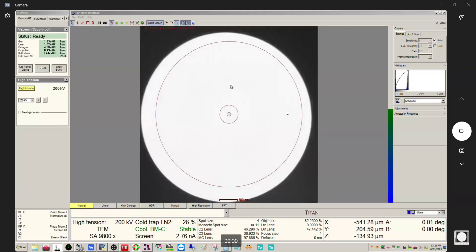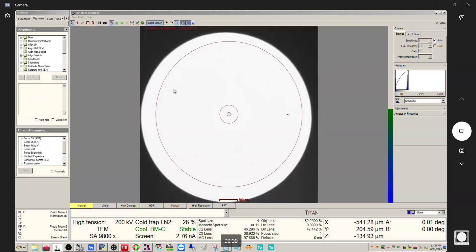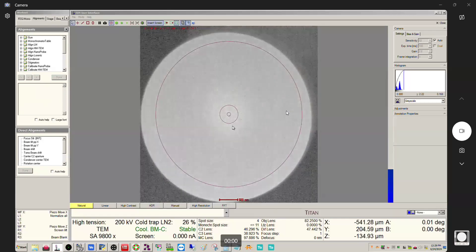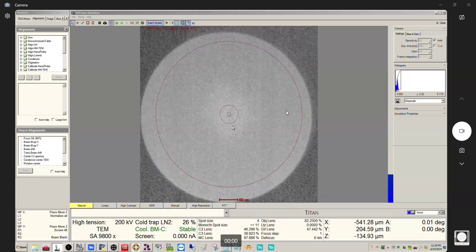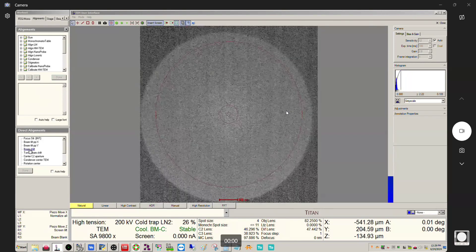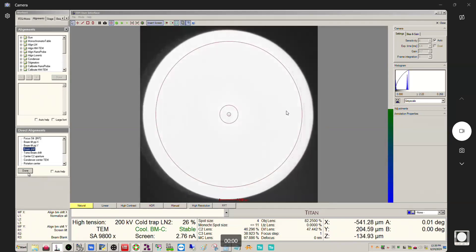We found the beam, and we can see it's well centered. Because I already set the alignment file beforehand, that includes the default beam position — you have a default beam position for both SA mode and LM mode. But let's say you accidentally shifted the beam way off center. One thing you can do before resorting to decreasing the mag is go to Direct Alignments, find where it says 'Beam Shift,' and click that. That recalls the stored default position for the beam, and from there you can fine-tune and save it.